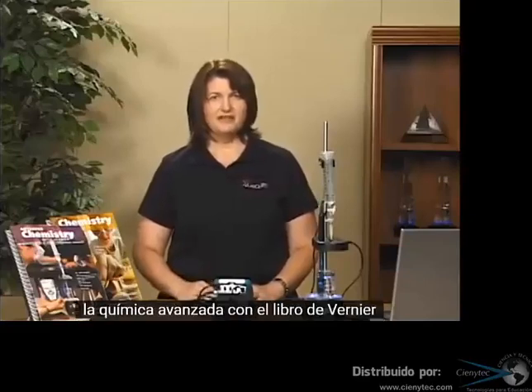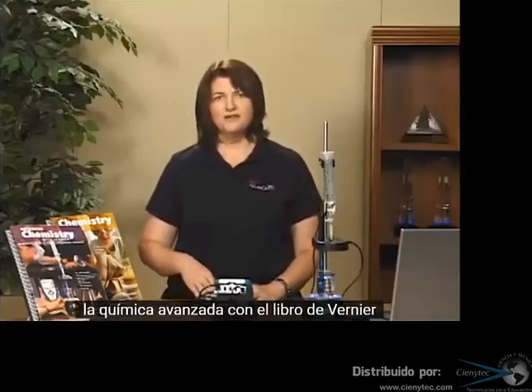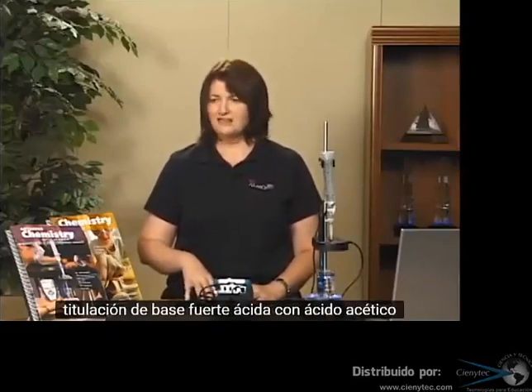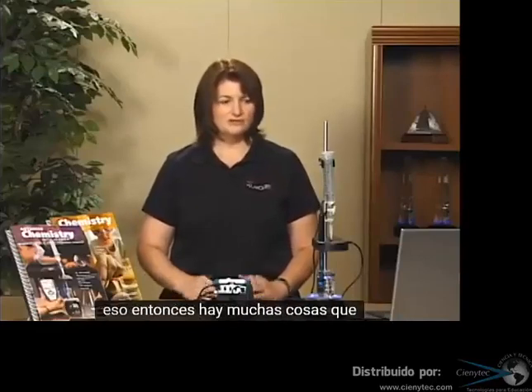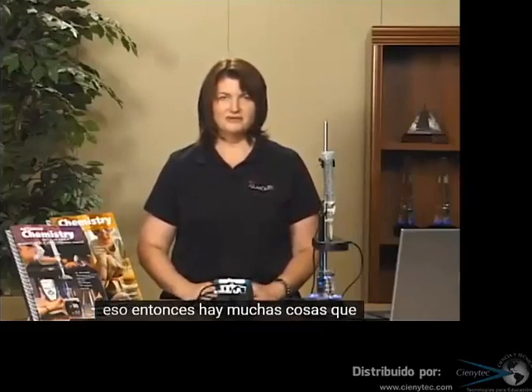So that was an example of a strong acid, strong base titration. If you're using the Advanced Chemistry with Vernier book, that experiment continues with a weak acid, strong base titration using acetic acid. And then in both books there are several other titrations to do, such as one with a diprotic acid and things like that. So there are many things that you can do as a titration in chemistry courses.